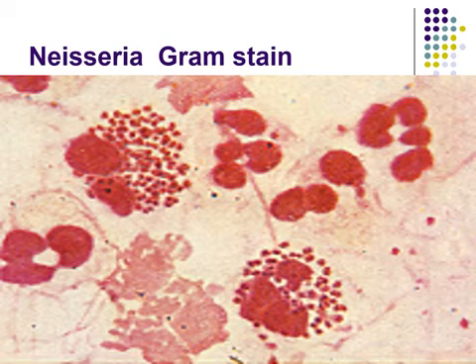This slide shows gram negative diplococci of Neisseria surrounded by polymorphonuclear cells.